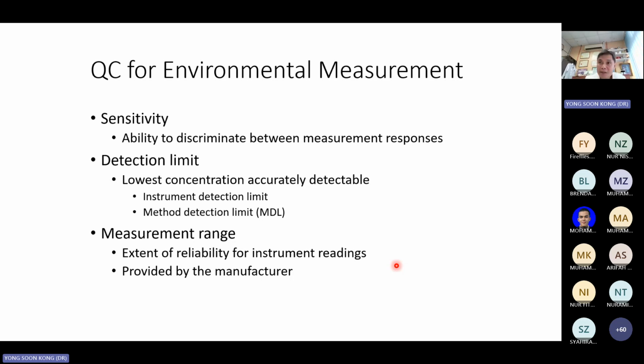That's it. But then again, you have to find out the technical documents of that equipment. Every equipment has a certification. It will state what its sensitivity is, and if it is sensitive to such-and-such, what level of DO it is expected to be able to read. So you match. If that is the range it can read, you compare with the previous report from the Department of Environment on Sungai Tua, how high the DO level was. If that previous report's level falls under the detection range of your equipment, then okay, you can bring it.